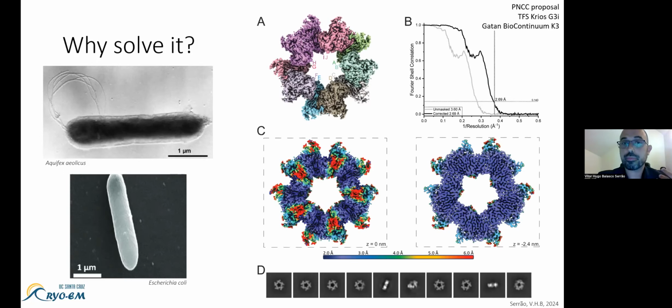Okay, so we start again this collaboration years after I finished my PhD to actually solve the high resolution structure. Professor Simonović sent me the plasmids, I expressed, purified, and did a bunch of screenings. As you can remember, it is a kind of tricky condition because I cannot increase the concentrations that much because the SelA starts sticking to each other. So I don't want to solve the stacked conformation. I want to solve the free particles. So getting the perfect condition in terms of the grid type, the concentration, etc., was a little tricky. That requires a lot of sample optimization.